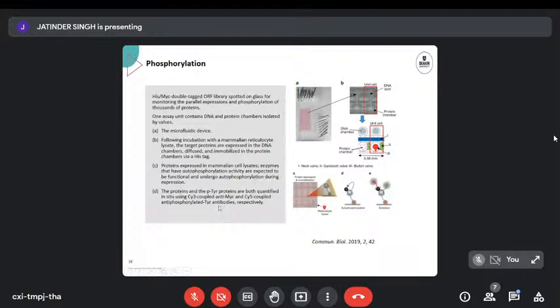And then you can measure the phosphorylation using an ELISA-like assay, where you get two antibodies sticking together before getting your fluorescent reagent. And then by comparing the synthetic DNA library with the cell-based library, you can get an understanding of what the difference is in phosphorylation, or whether the cell extract actually did express any phosphorylation or not.